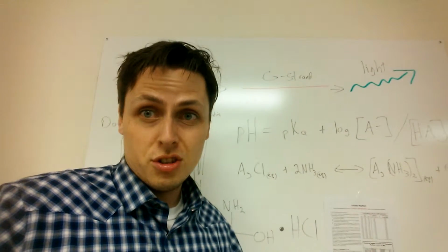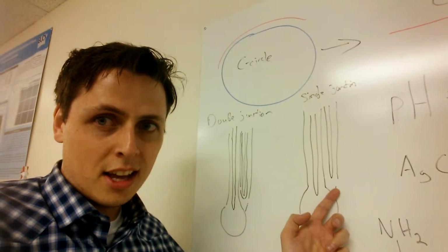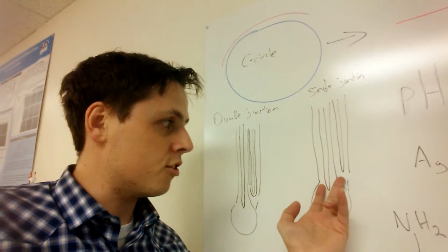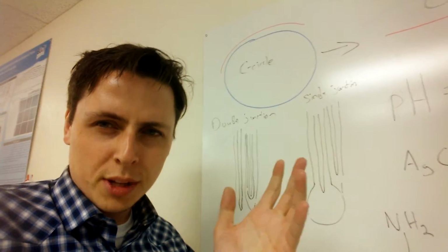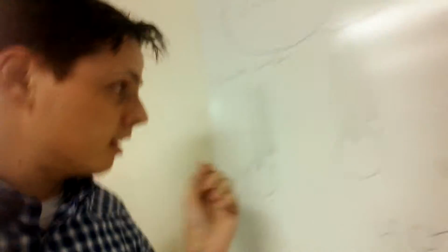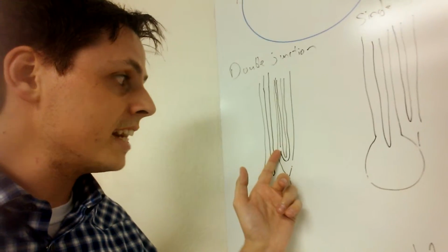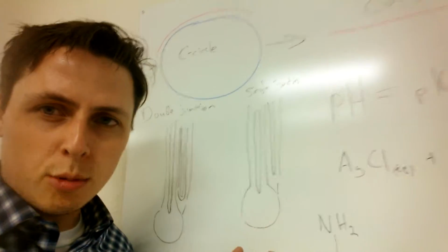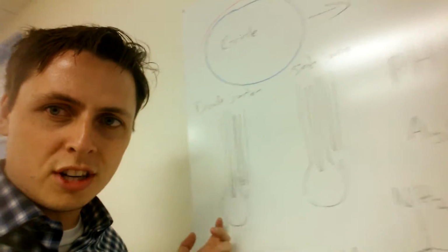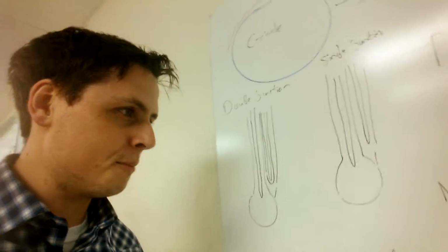So it's huge. This thing is huge. It falls out of solution, and it clogs this junction here, which prevents the potential from being measured across these electrodes, which makes the pH reading totally wrong. And the really important thing about a double junction pH meter is that we have this junction here, and then we have a secondary junction here. So this problem that I was having can occur with a single junction pH meter. So that's why it's so important to have a double junction pH meter.